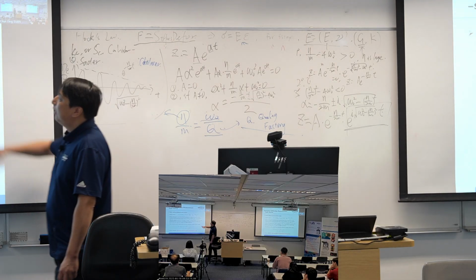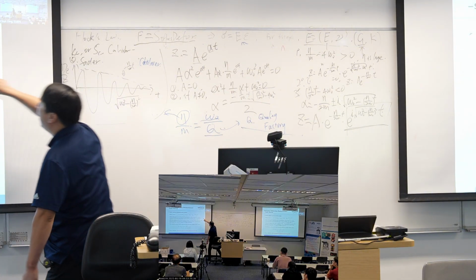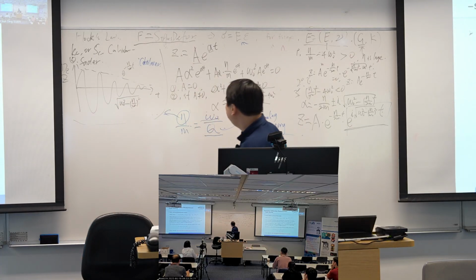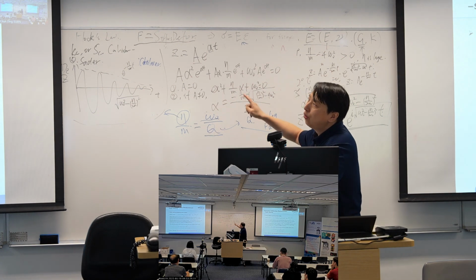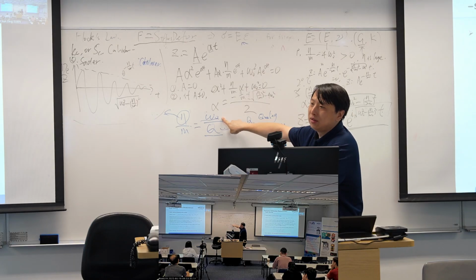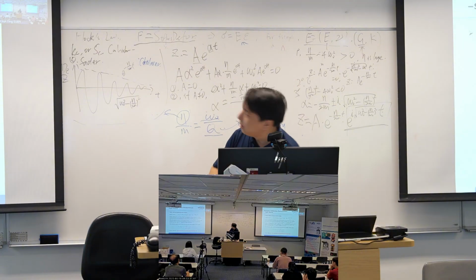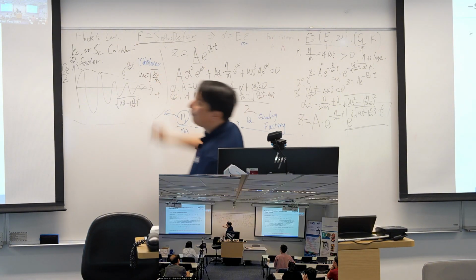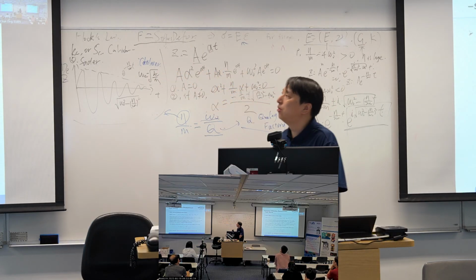So we calculate out the hydrodynamic force. Actually, we get eta out, and then if we can measure the quality factor of our cantilever, the omega 0 is out. The omega 0 we know is the square root of Kc over m, so finally our Kc is inside the omega 0.